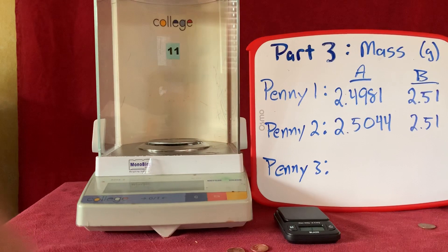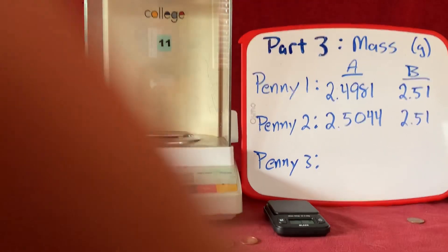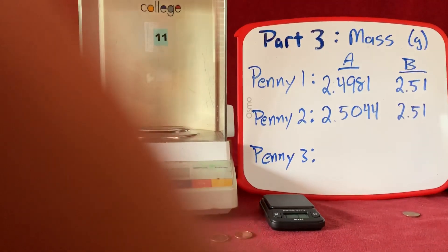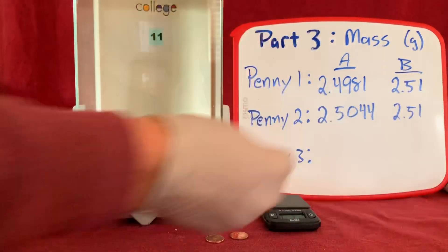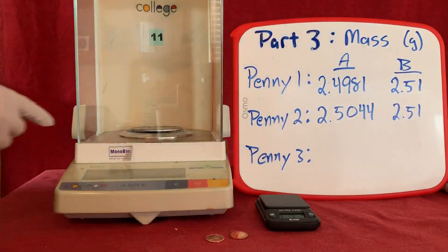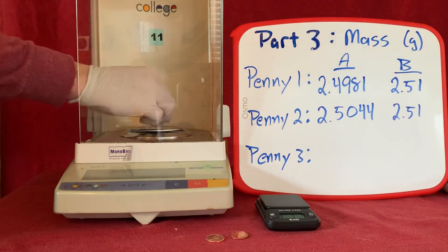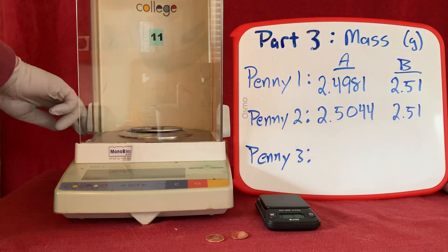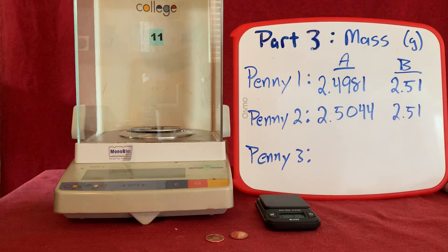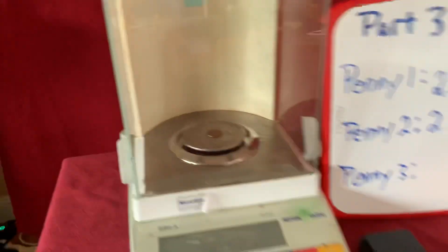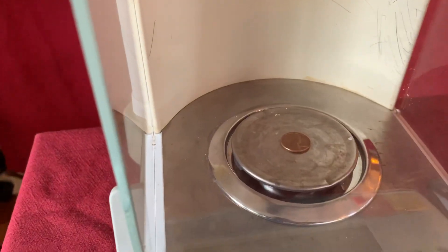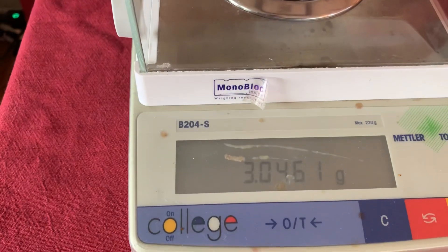Now the balance is very sensitive to vibrations. So I need to make sure I'm standing very still so that it takes an even reading. Let's take penny three and get the mass of it. You might notice that I'm wearing a glove. This isn't because pennies are particularly hazardous, but I want to make sure I'm not getting any oils from my fingers on the things that I'm trying to measure. Now I've got the penny in there. You can see it sitting in the middle of the pan. Let's see what we have for our measurement.